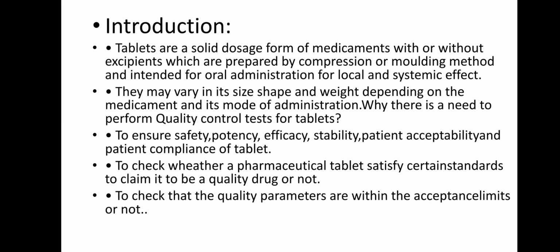Introduction. Tablets are a solid dosage form of medicaments with or without excipients, which are prepared by compression or molding method and intended for oral administration for local and systemic effect. They may vary in size, shape and weight depending on the medicament and its mode of administration.